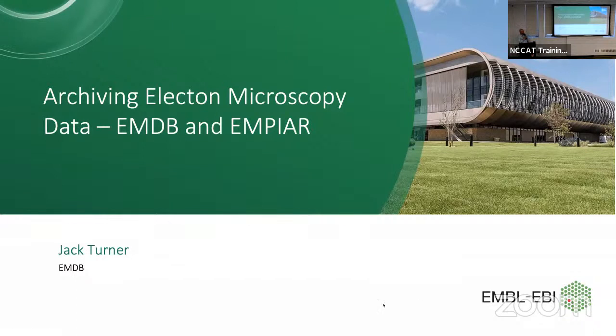Something that's special why we're bringing Jack on is a lot of you are creating a lot of tomo data sets. And the question would be, you're going to publish that, and how can you actually archive that, not only in the EMDB, but EMPIAR? And I think that is sort of a topic where it might be easier now because of Jack. We'll find out pretty soon. So Jack, take it away.